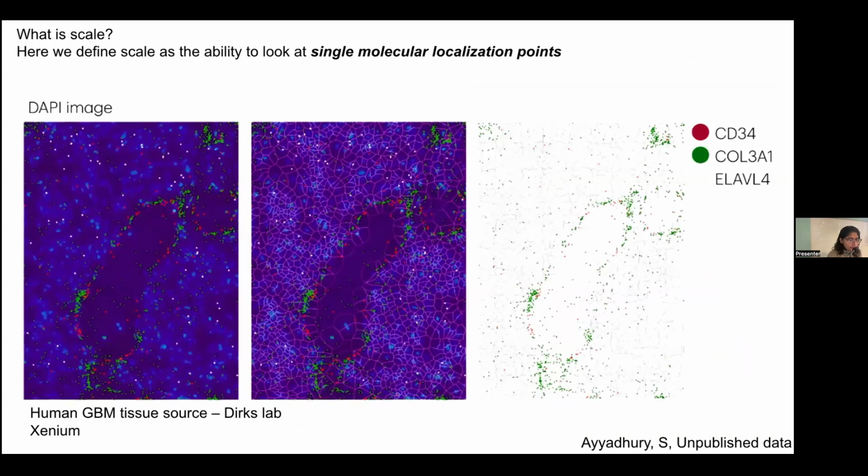And then, yeah, this is just an example where you can simply look at the distributional patterns of your genes as opposed to simply looking at cell features. Previously, in module 4, Savannah introduced the concept of gene modules.